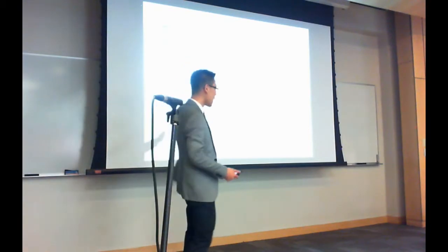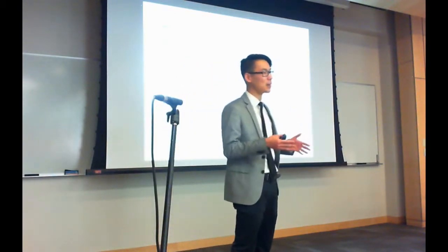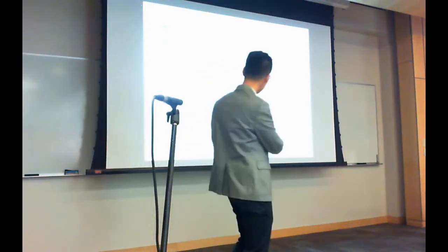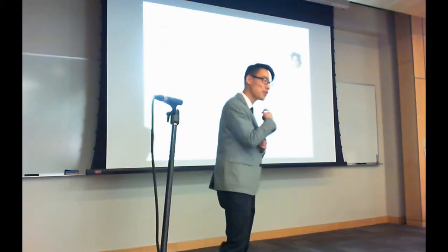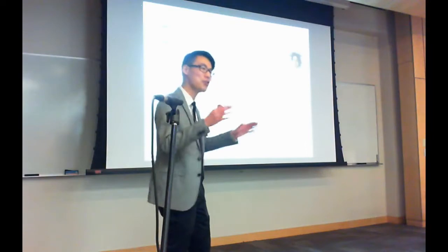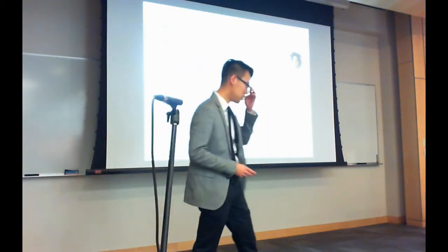And perhaps some library spectra, some spectra in general, are much, much easier to match with a high cosine score than others. And so Nuno and I worked on this problem, and we came up with a solution called the spectral library generating function. So it's a mouthful, but just very, very high level.